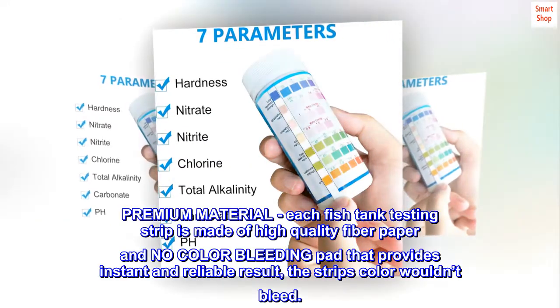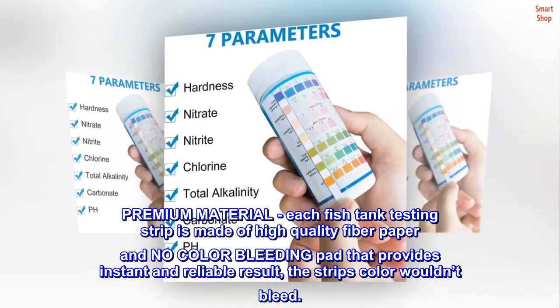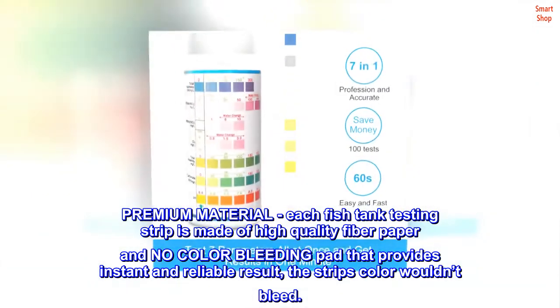Premium material: each fish tank testing strip is made of high quality fiber paper and a no-color-bleeding pad that provides instant and reliable results. The strip's color wouldn't bleed.